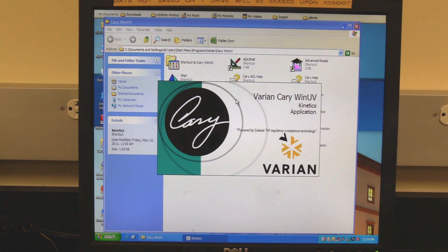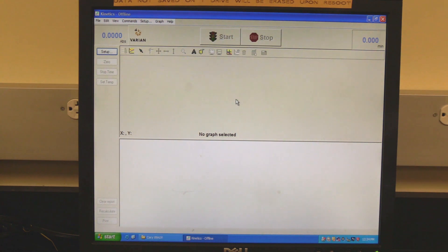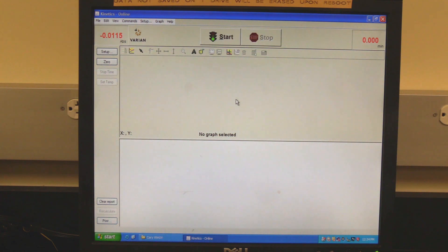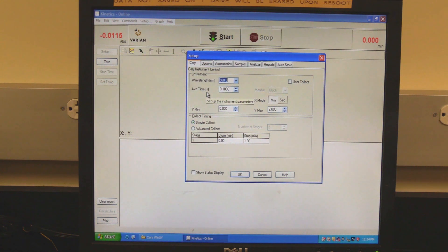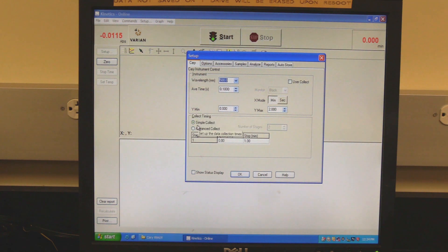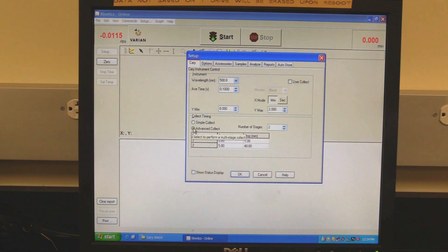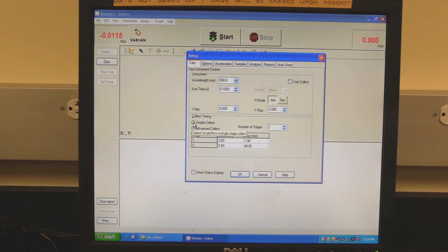Kinetics measurement: in the Cary Win UV folder, double-click on the kinetics icon. Wait for the software to open and initialize — the instrument will be finished initializing when the absorbance reading turns red. Click on Setup to set measurement parameters. Setup should open to the Cary tab. In the instrument section, set the desired wavelength, average time, and X mode time scale in minutes or seconds. In Collect Timing, select simple or advanced collect. Use simple if there is only one stage; use advanced if there are multiple stages. In the Cycle column, set the cycle duration; in the Stop column, set the end time for the reaction stage.